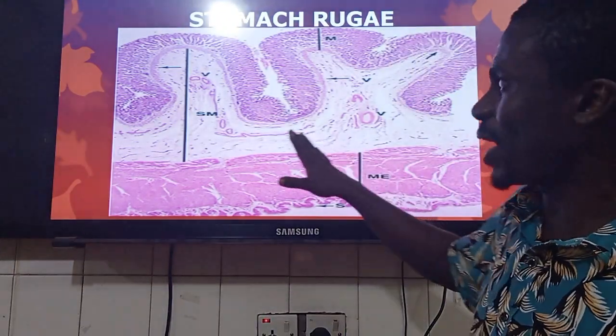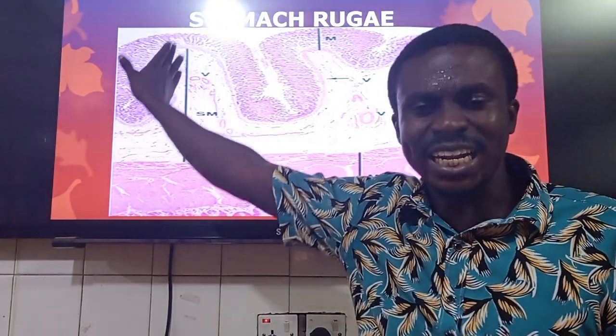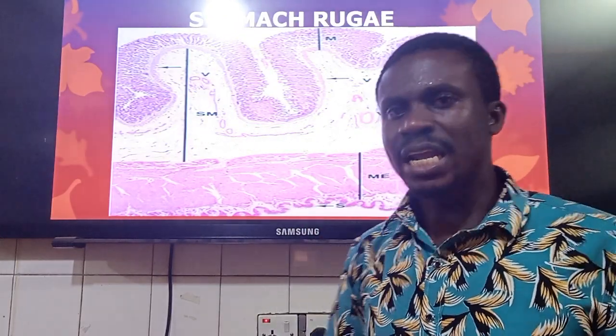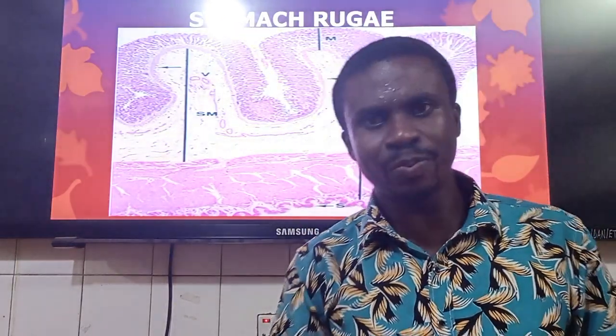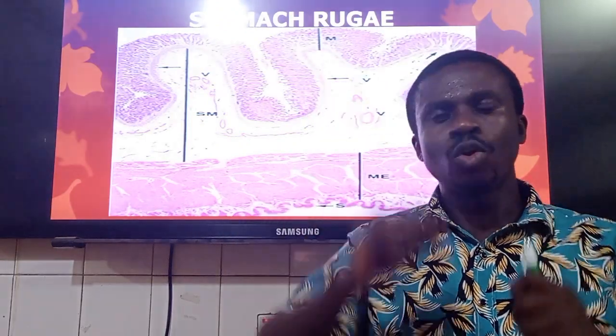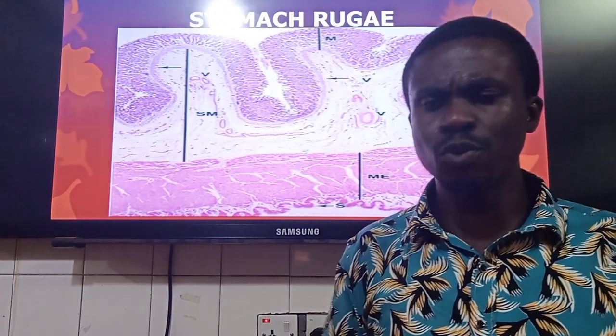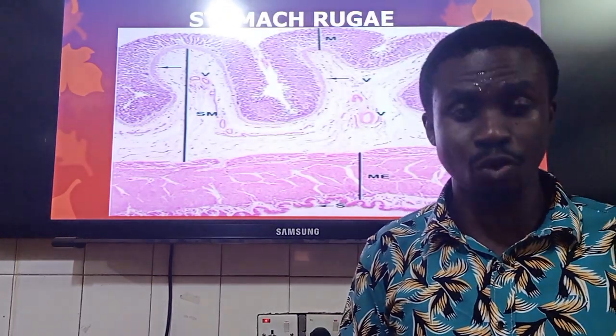And in the case of the stomach, what we see is that the epithelial lining is going to be a simple columnar epithelium without goblet cells. Now, one time I was confronted that people can see a pale stained area, okay, apical to the columnar shaped nuclei, or the oval shaped nuclei of the simple columnar epithelium of the stomach.